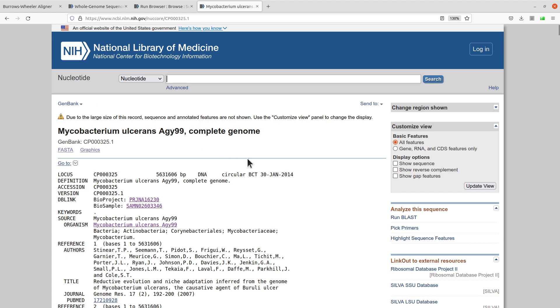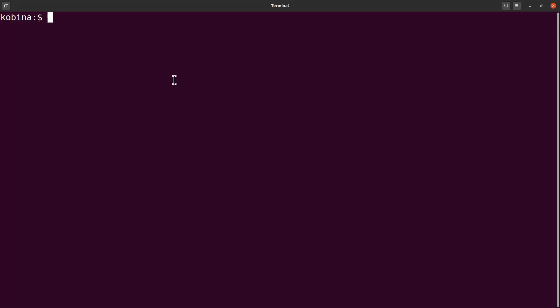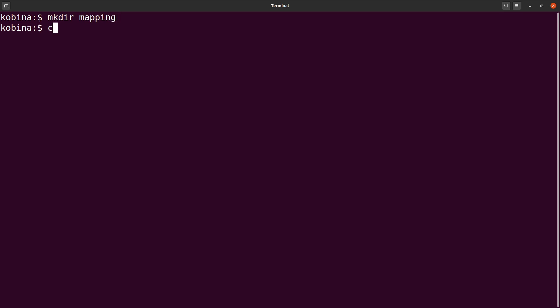Let's go to the terminal and start. The first thing I will do is create a directory — this is where I will be working. So I'll run 'mkdir mapping' and then 'cd' into it. Now I am ready to start the work.